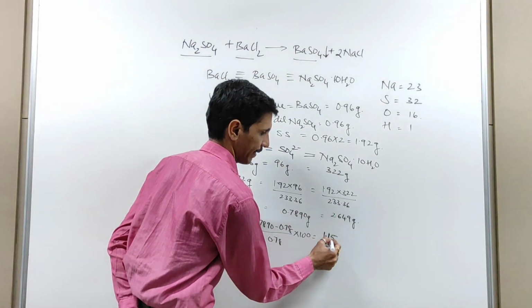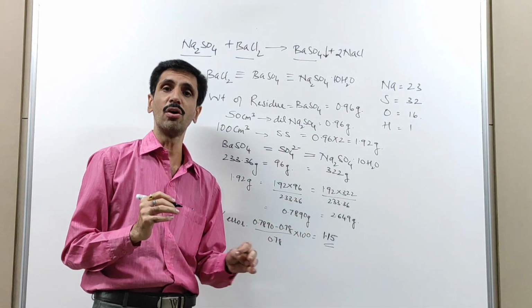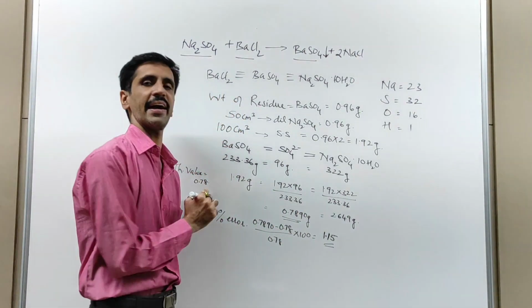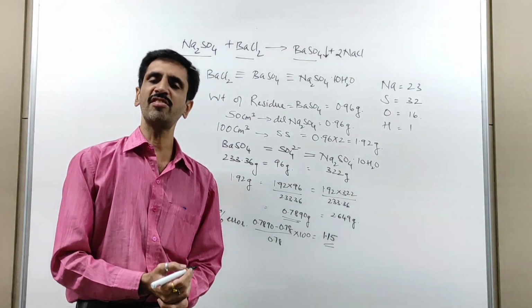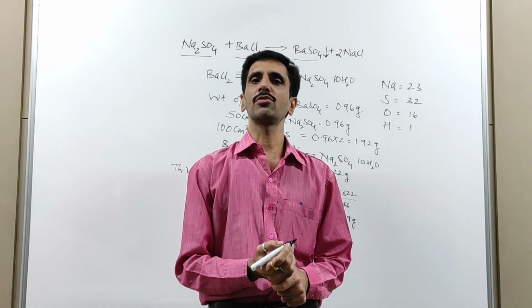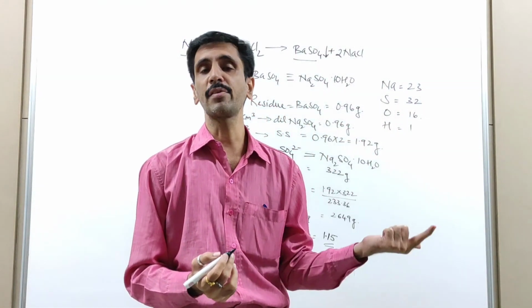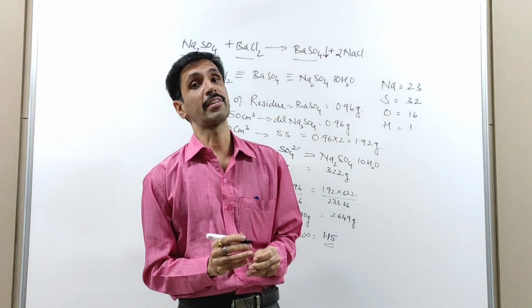So it's not that hard. Because this percentage error is low, the efficiency of the process is high. So the percentage error is 1.15, and as far as the quantitative estimation of the sulfate ion is concerned, we have 0.7890. Alright, so this is it, my dear friends. This is the entire experiment that we have considered with respect to the quantitative analysis of sulfate ion. I hope you have understood this very well. Please go through the first part of the video also, and then go for this part of the video for the complete understanding. So thank you so very much.